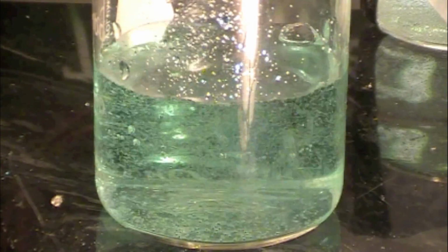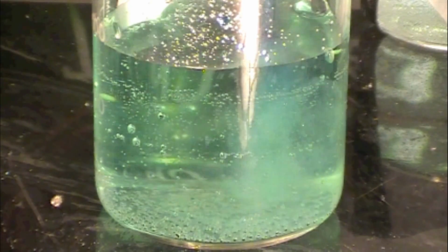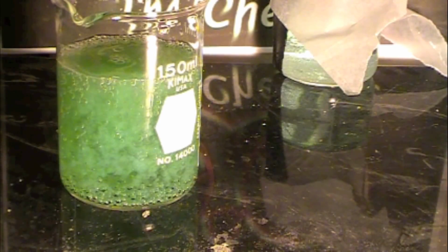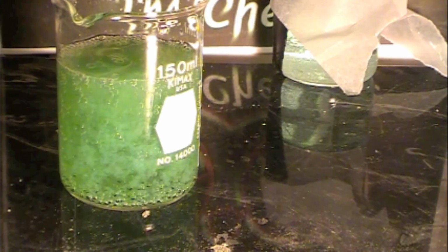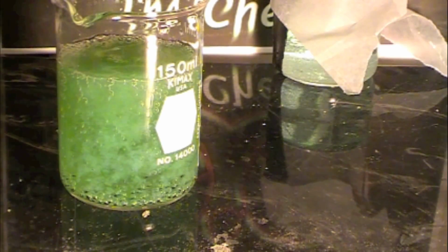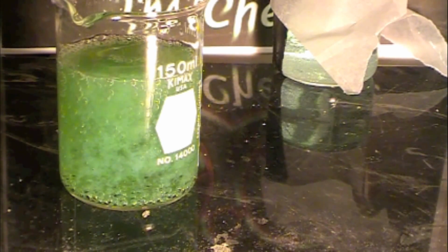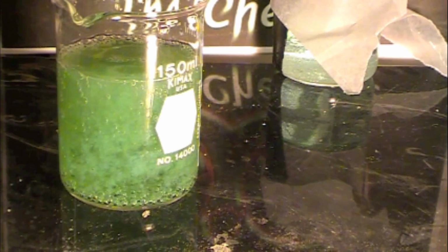On this episode of The Chem Life, we're going to be making rayon through the copper ammonium method, and this is a continuation of a previous video on how to make Schweizer's reagent. So if you haven't seen that, you should go see it now. The link is in the top right, just click that now. Otherwise, we're going to make it here. So what we're going to need are a few basic things, including the Schweizer's reagent from the previous video.